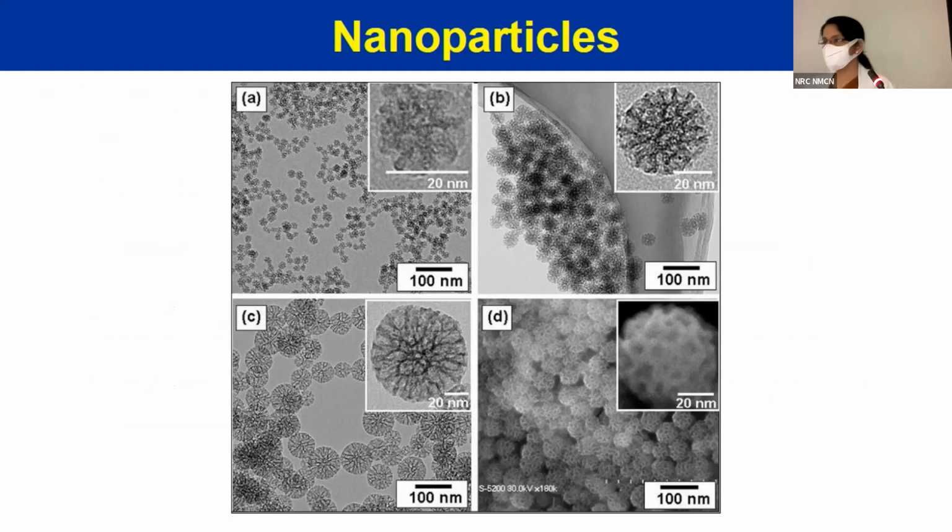This is something which fascinates a lot of people, so that is why I put in the pictures. Nanoparticles. So these are very small particles which can be looked at by an electron microscope. And the size varies from 1 to 100 nanometers, and therefore you have this bar.